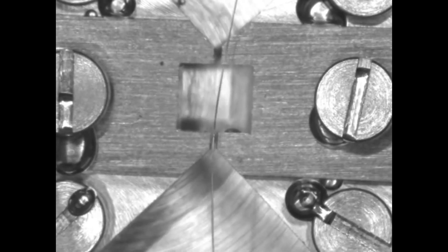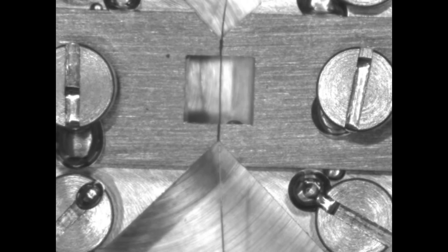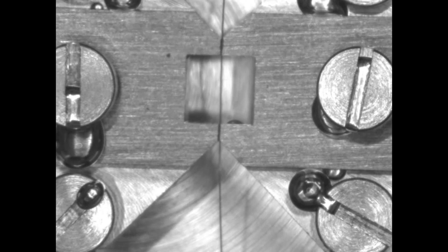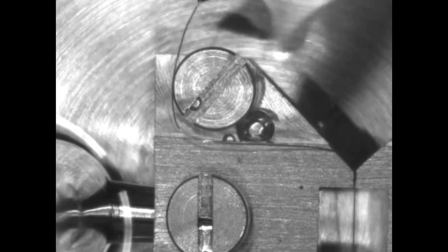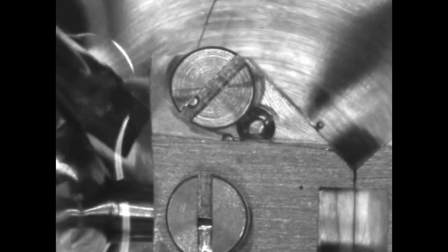To begin mounting, you should place a piece of wire between your two jaws. Clamp the wire in place by using the micrometer to hold the wire in place. You should secure one end of the wire under the screw. It does not matter which side you secure first.